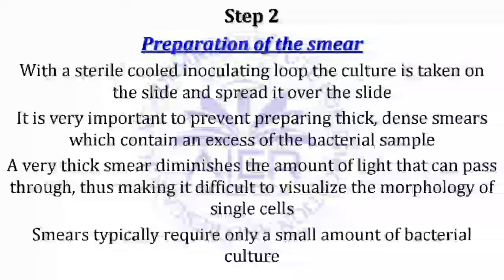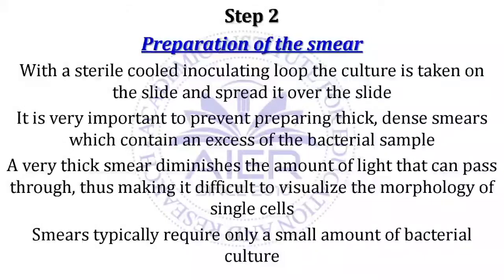Preparation of the smear. Smear means bacterial smear, as we came to know about the blood smear. Like this, from the culture media, we have to collect the bacterial species or strain by means of an inoculating wire. With the inoculating wire we pick the bacterial sample, and thereafter we need to draw the smear over the slide, right?